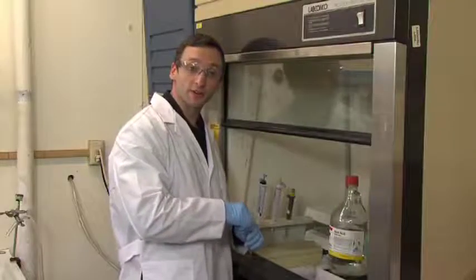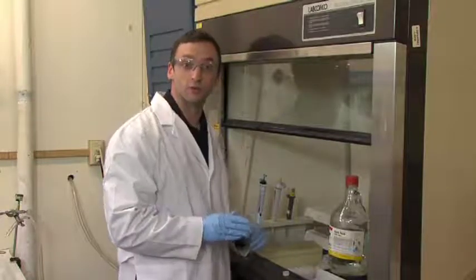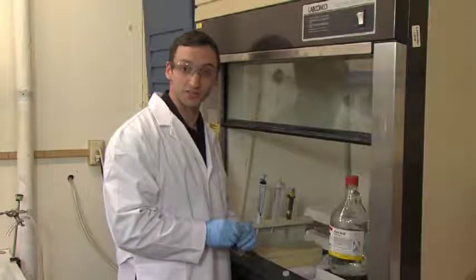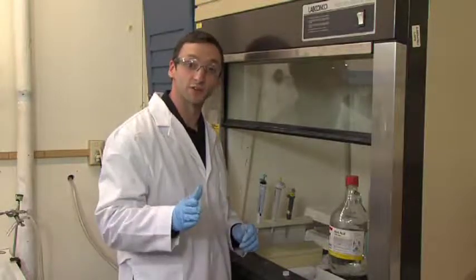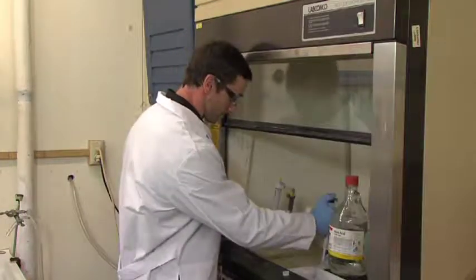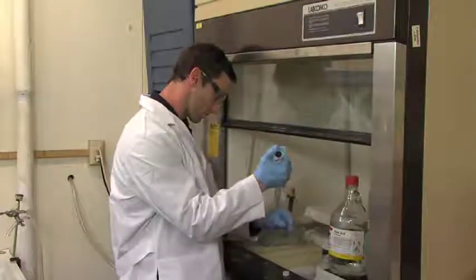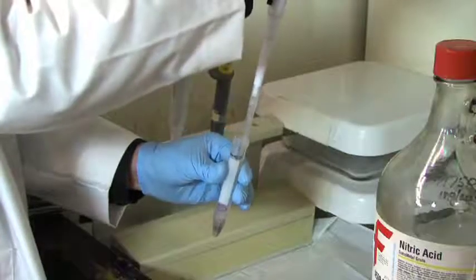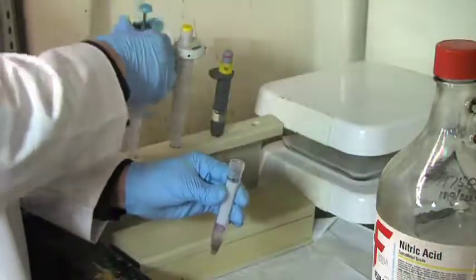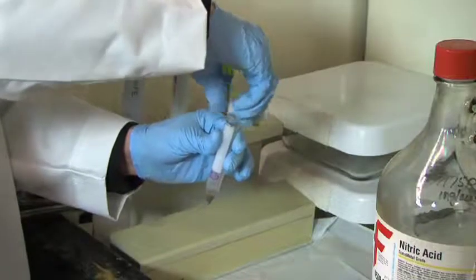To prepare samples for analysis, an acid or microwave digestion is performed. Acid and water are added to the digestion tube containing the samples, and the samples are heated for specific amounts of time. One aspect that's important to consider during the project planning is that the holding time for metal samples is 6 months for metals other than mercury, which has a 28-day holding time.